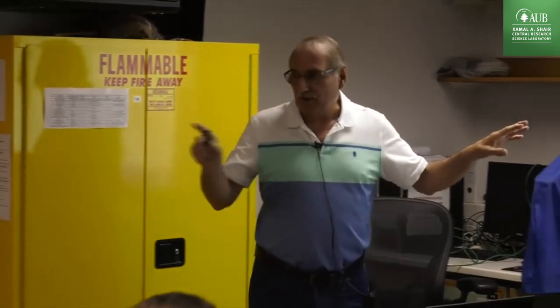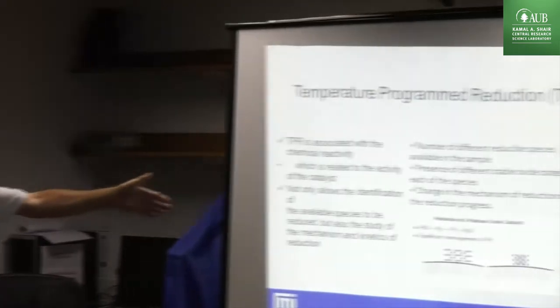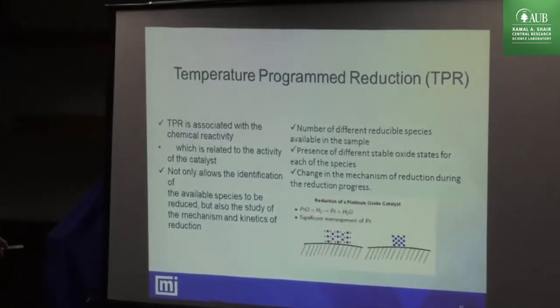I'm going to show you an example of how nice it is. Just one minute. Okay, the TPR is just, as I said, a reaction. As you see, it's a reduction by the hydrogen.